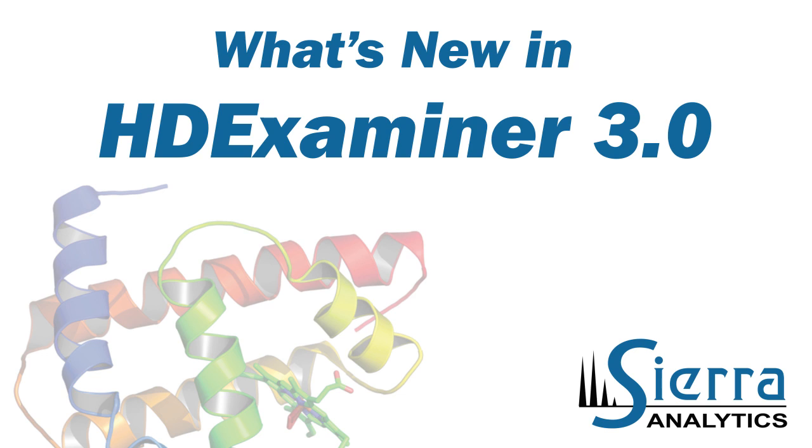It's been a while since our last video, but that's because we've been hard at work building HDExaminer version 3, and this video will tell you all about the new features in that version. So let's dive right in.